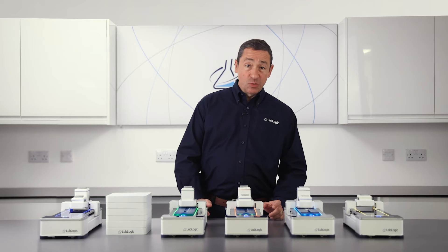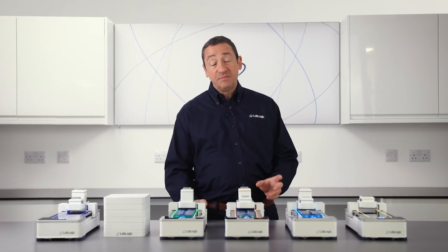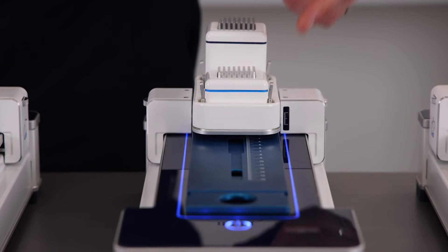For customers working with a wide range of isotopes, the TLC Duo version of the ScanRAM has space for two detectors of different scintillator types, meaning that the most suitable detector is always available.